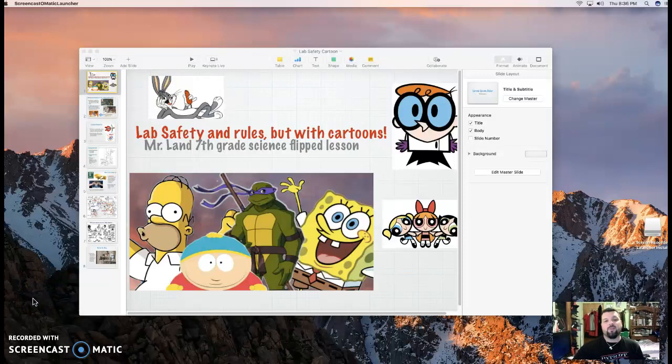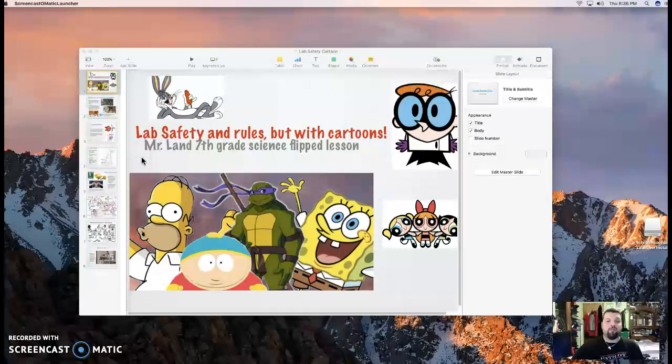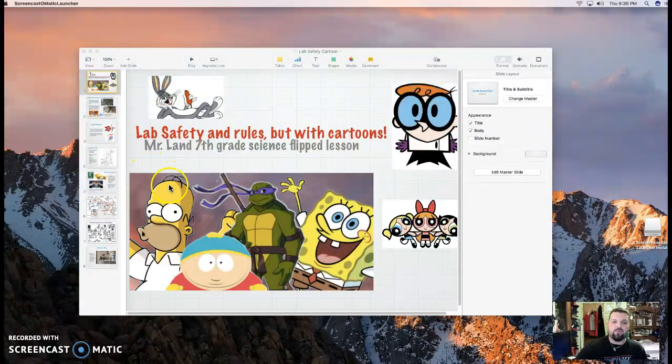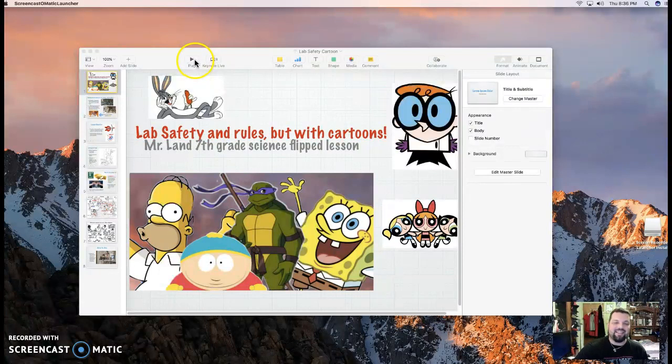Alright kids, welcome to the flip lesson here with Mr. Land. In 7th grade science, we are going to learn a little bit more about lab safety and rules, but we're going to use cartoons. Not Homer Simpson or SpongeBob, but just some regular lab cartoons to try to identify some of the correct and incorrect procedures in the laboratory.